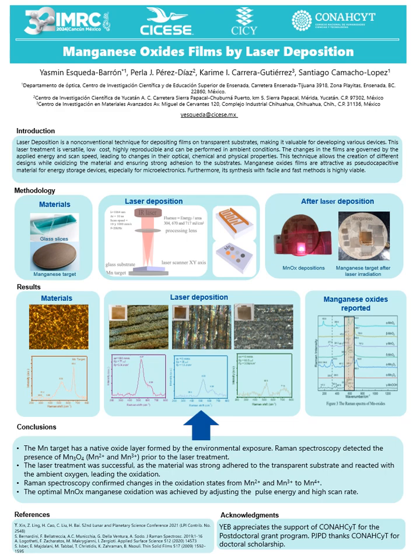In contrast, using a scan speed of 10 millimeters per second and lower pulse energies of 35 microjoules tends to form the same compound as the higher speeds but with lower concentration.